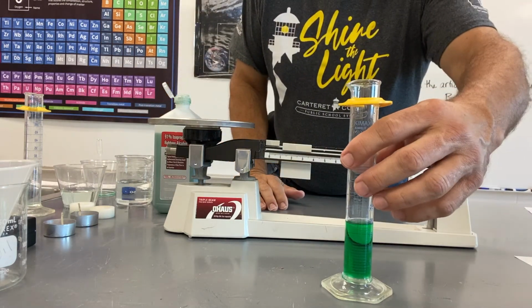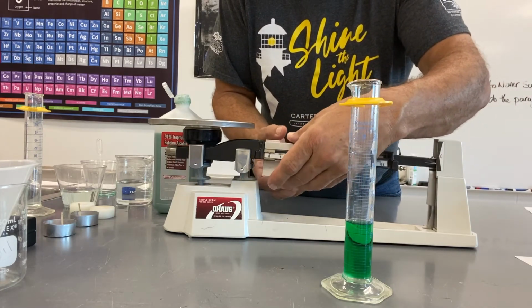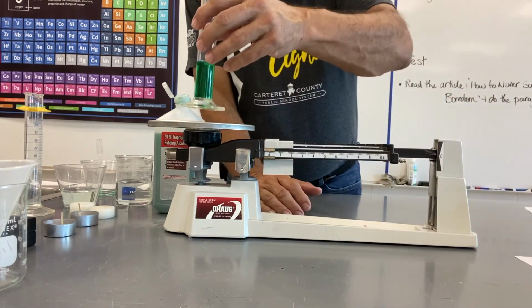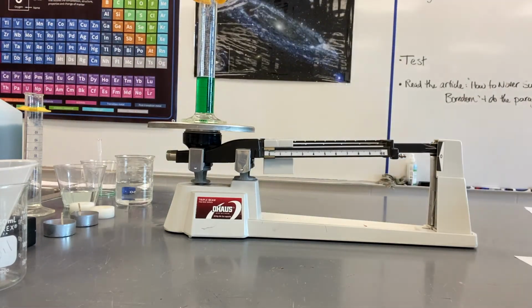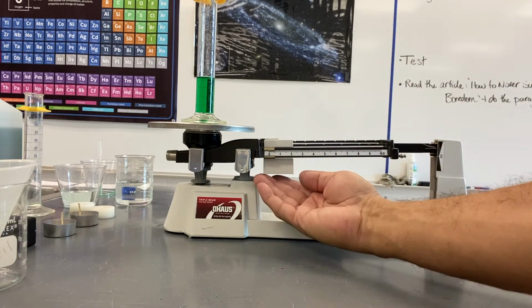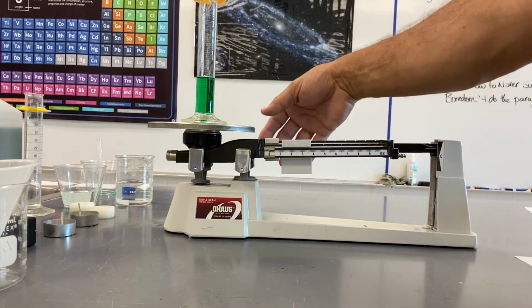Okay, and let's see what this weighs. I'm going to start back at 0 again. Not a big deal to do that, but just keep the experiment clean. You might have a memory of whether alcohol or water is heavier. We just weighed water, so that might give you a clue as to what you could have done with these, but we're going to start from scratch just so it's as clear as we can make it. All right, let's check it at 100. That works.